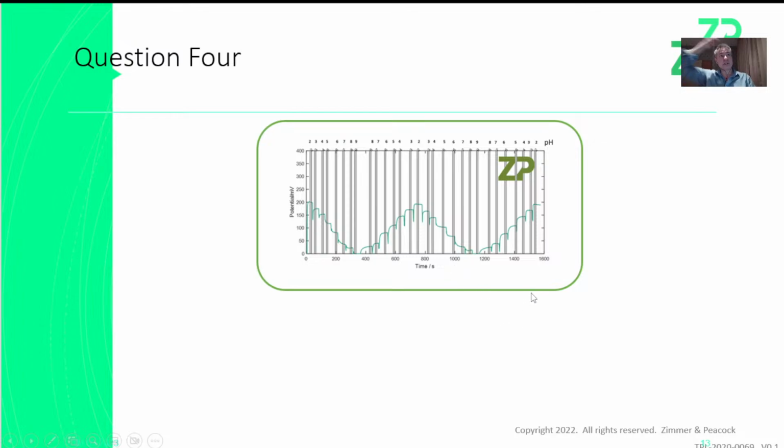The thing I would say about the pH sensor is it's a very robust sensor for us. The thing about biosensors is, unlike a temperature sensor, where the sensor is essentially shielded from the sample, often by some sort of polymer or metals, with a biosensor it's in intimate contact with the liquid.